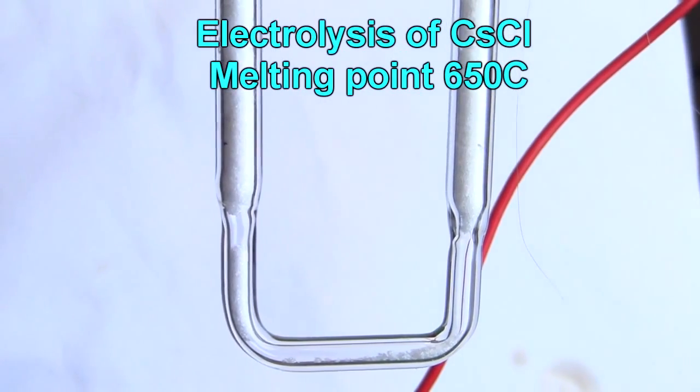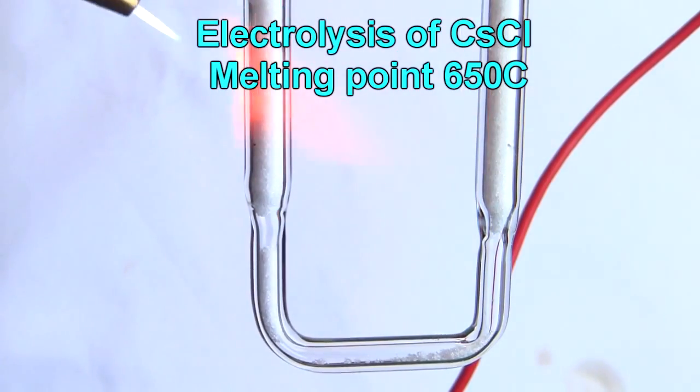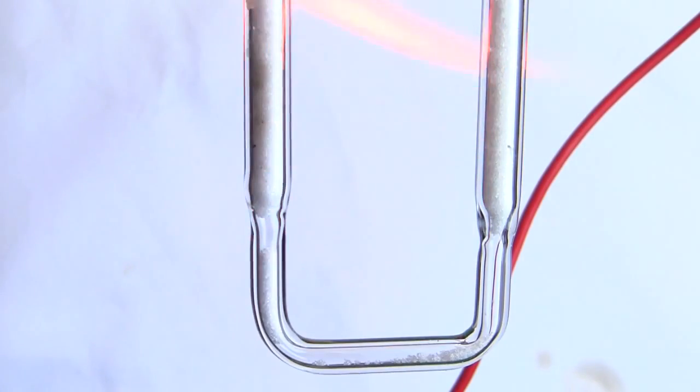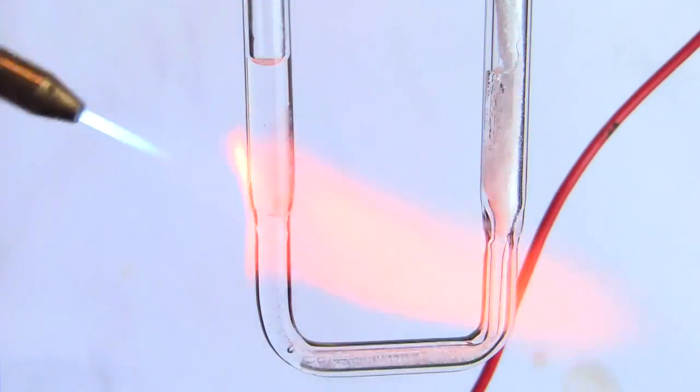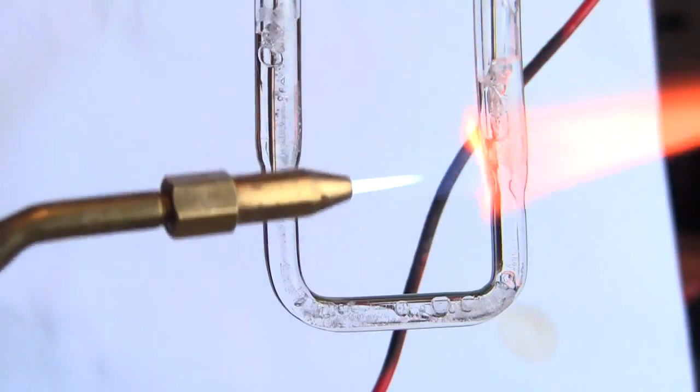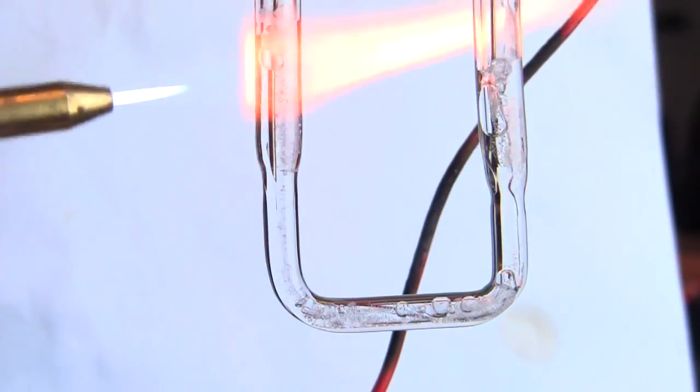So the reason I've got it in this little U-tube type thing is to keep the electrodes separate. So I keep the generation of this blue solution or this cesium, whatever it is, separate from the chlorine. Because those things will react really quite violently if they come into contact. Plus it would obscure the clarity of the experiment.